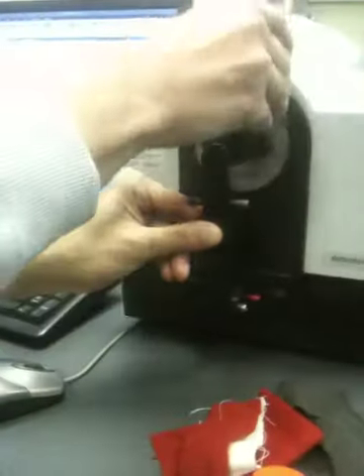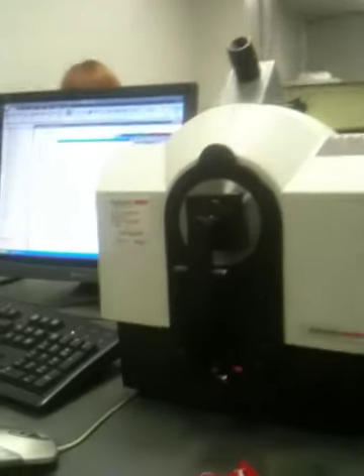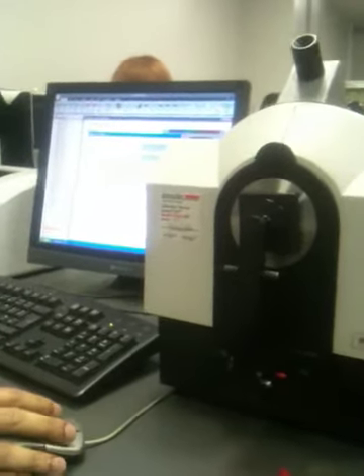And it says it's the white tile. It says here pass. Alright, anything below 0.1 is good. Now you are ready to do your measurement.